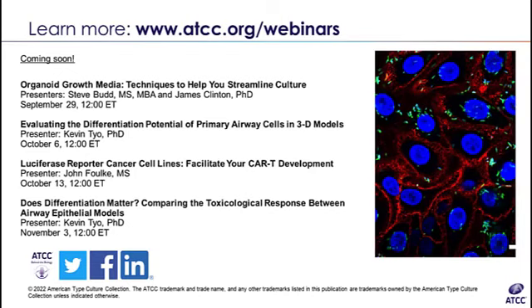Yeah, I'll just jump in and then let Michael give any more detail. It's a good precaution, but as long as the biological cabinet you're working with has the proper flow rate, that should be sufficient for really any contamination issue. But I'll let Michael say anything about that if you'd like.